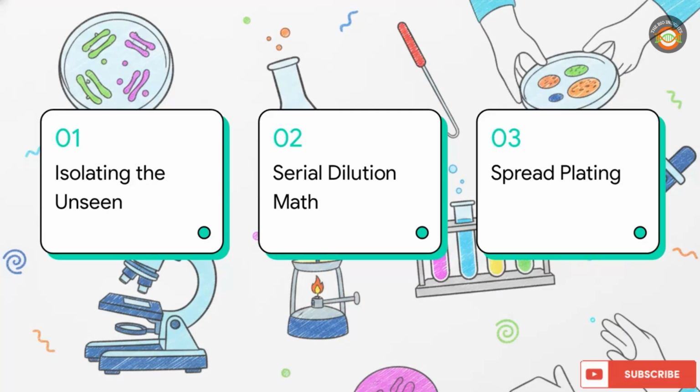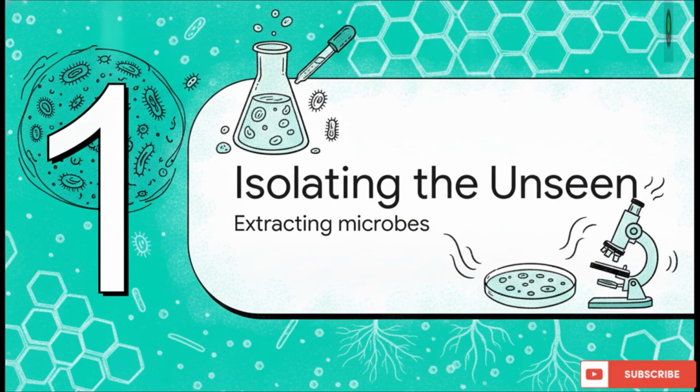Okay, let's dive into this. We've structured today's lab session into three main parts. First, isolating the unseen. Second, the math of serial dilution. And finally, aseptic spread plating techniques. Let's start right off with Section 1, isolating the unseen.